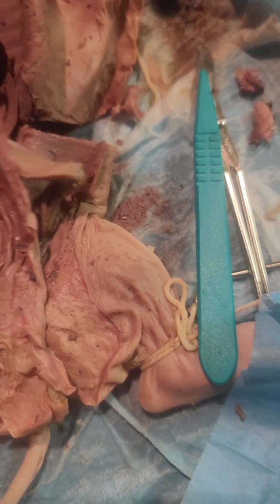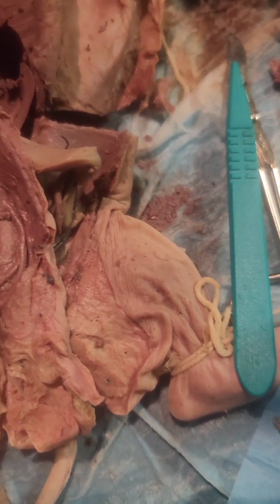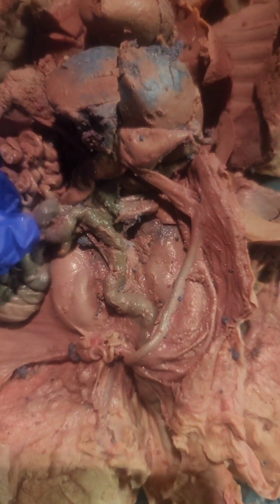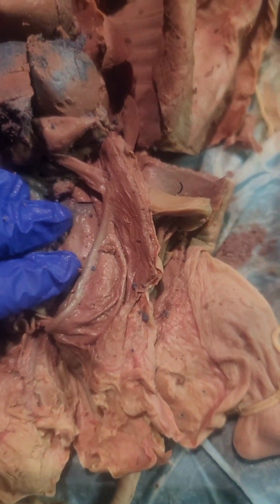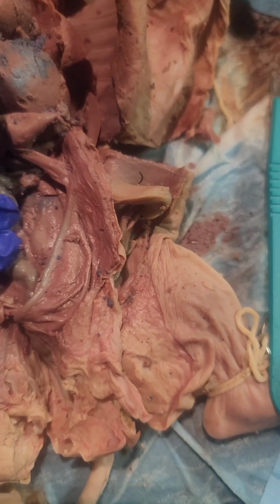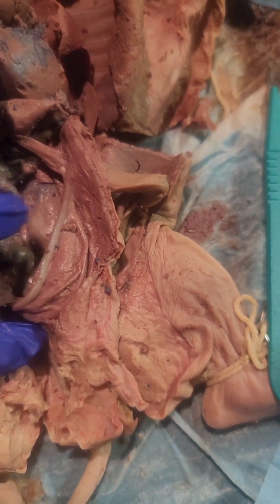And then from the spiral colon goes, here's the end of it, goes down through the rectum and out the anus, which I kind of cut the very end where a sphincter would be, unfortunately, but there it is. Thank you.